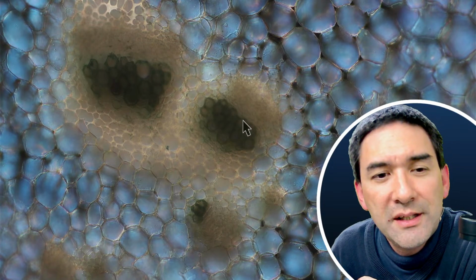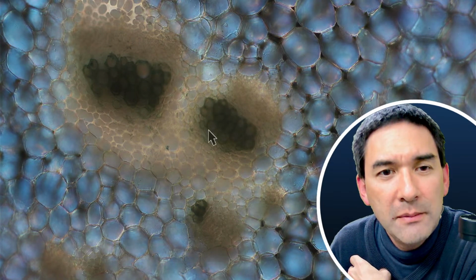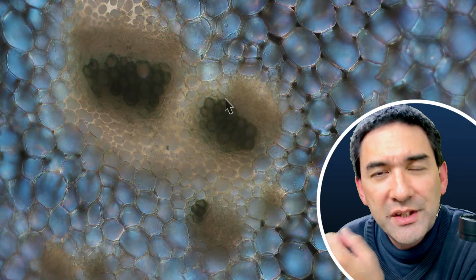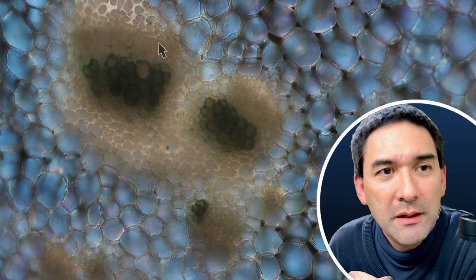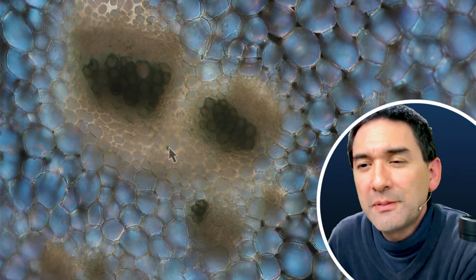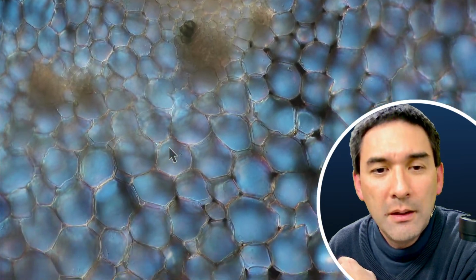So I suppose that this here would be the so-called xylem, which transports the water up the plant. And in many plants, the xylem is also reinforced and has thicker cell walls for stability purposes. So those cells are not only important for transporting water, but also for giving stability to the plant. So these are the so-called vascular bundles, right? And they're essentially responsible for transporting substances.